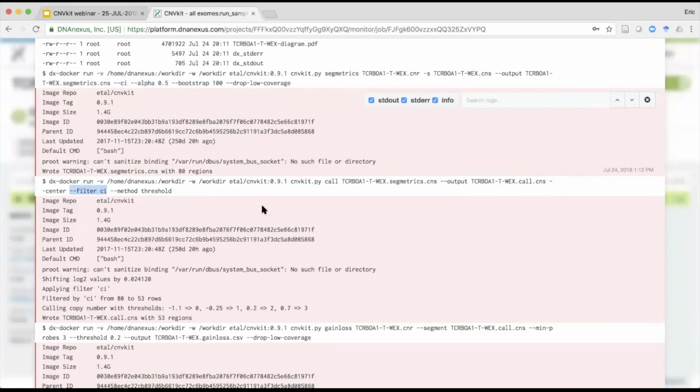So what's left after this is a neutral baseline plus copy number alterations that were supported by confidence interval analysis. We also recenter it so that the neutral values, instead of being close to 0, are directly at 0. If this goes wrong without this step, you'll know, but I won't get into it. And the output of all of that is your call.cns file, the copy number segments.